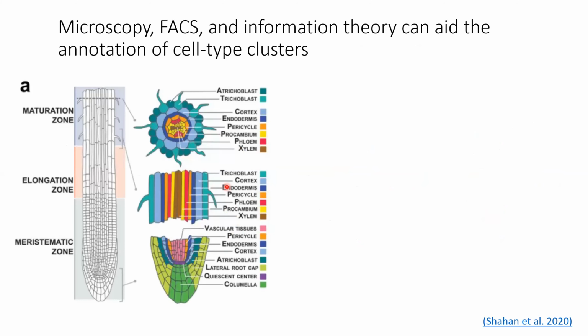Okay. So what does the Theis lab mean when they say combine prior biological knowledge of marker genes with clustering algorithms? Well, it can be as simple as just having a list of several genes that have been previously demonstrated to correspond to important cell physiologies, and using this list of marker genes to annotate your cell clusters. Or the approach can be more sophisticated. Like, for example, people are starting to use machine learning to try to identify the most informative subset of genes for classifying cells. But my words of caution here are the following.